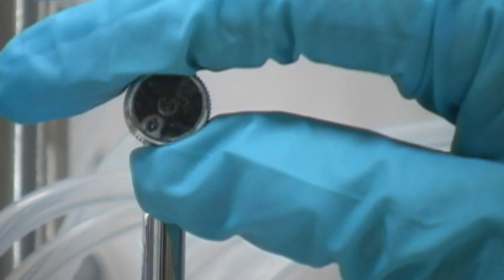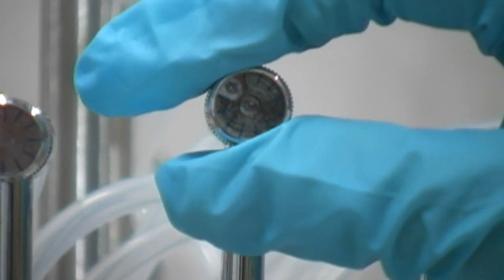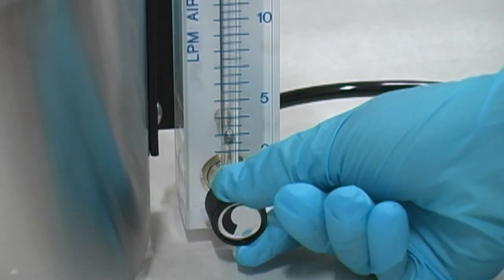Raise all valve tubes to their highest position. Turn all needle valves on the valve tube assembly off by rotating clockwise. Close the valve on the flow meter by rotating clockwise.